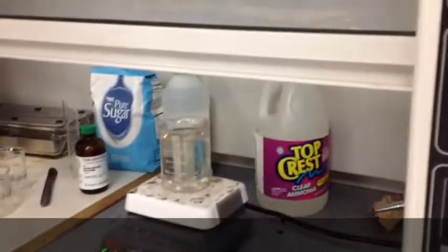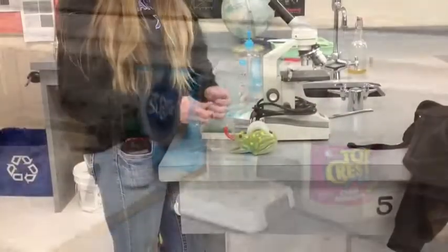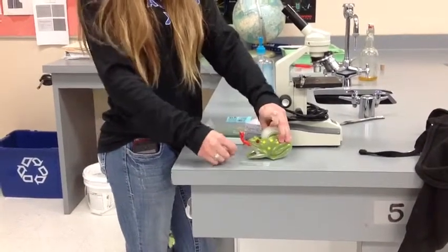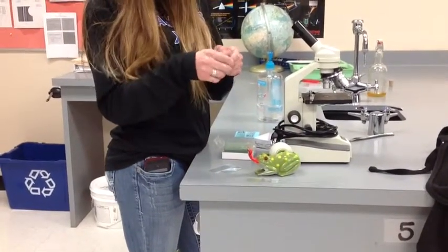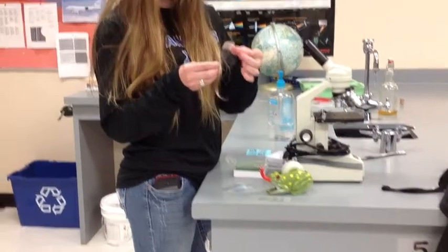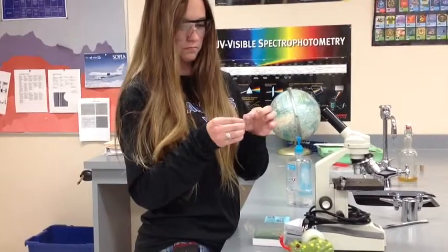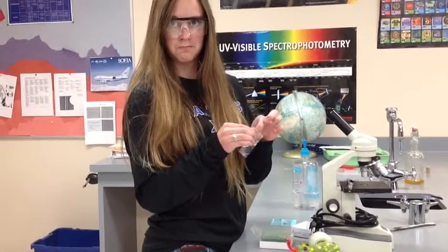Just let it sit until you put your slides into the beaker. Before you put your slides in, make sure you tape up whatever you don't want silvered on your slides. We just did the top of each slide — put some tape on there, and that will keep it from silvering.